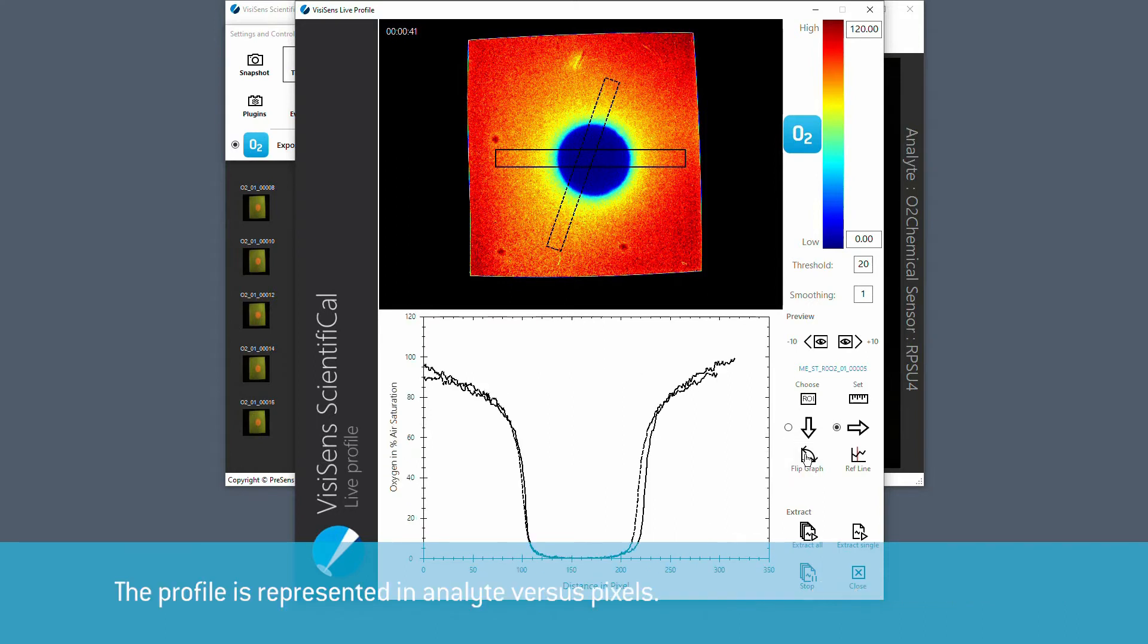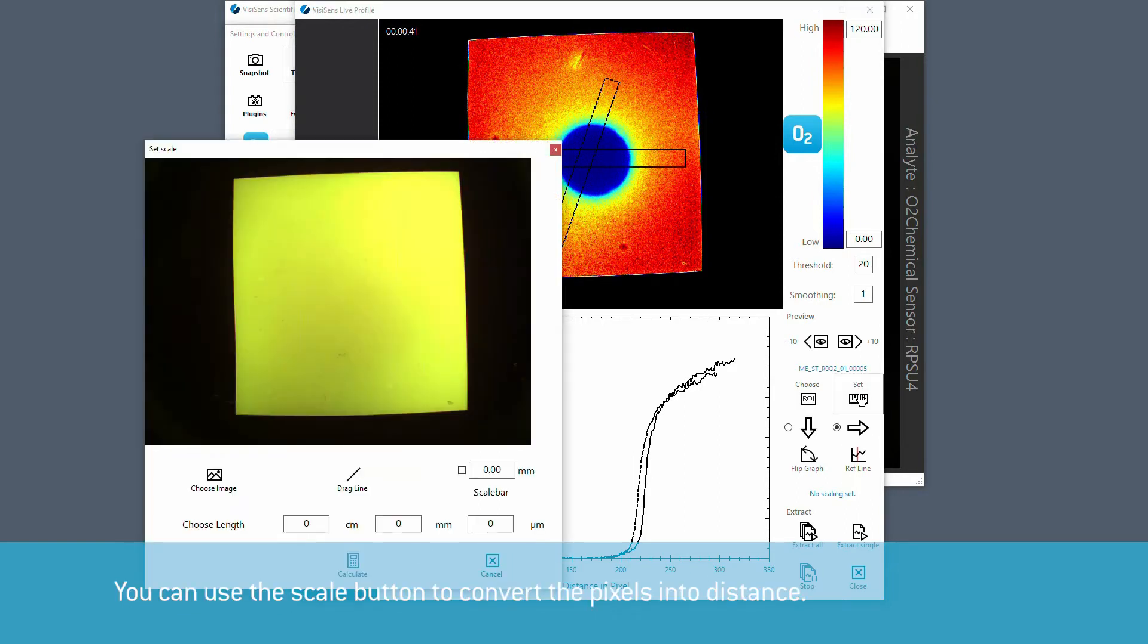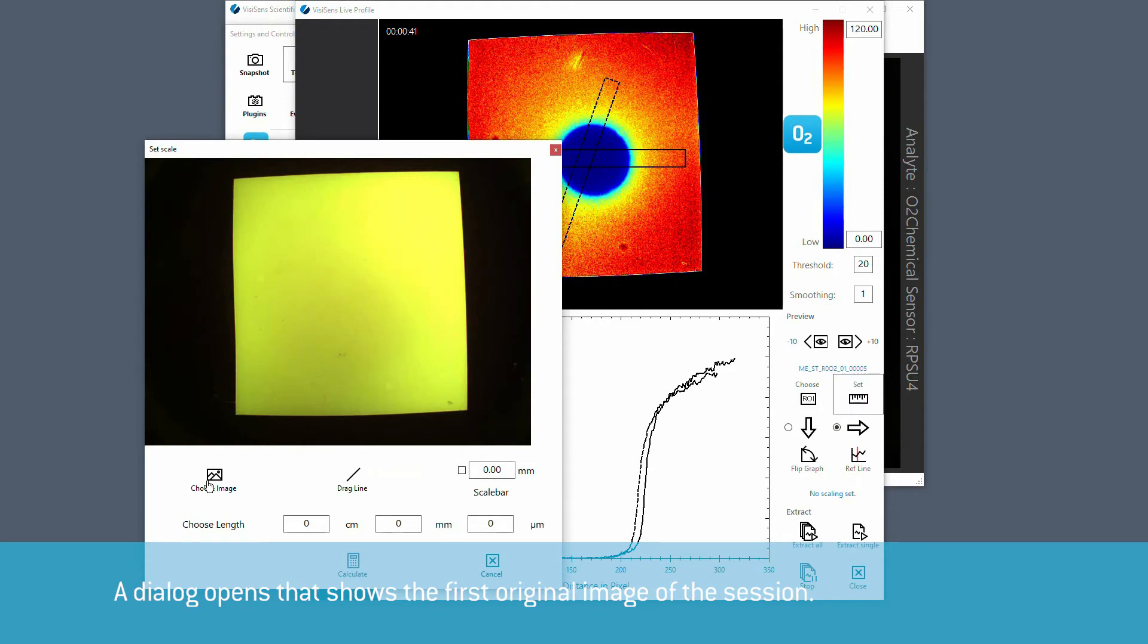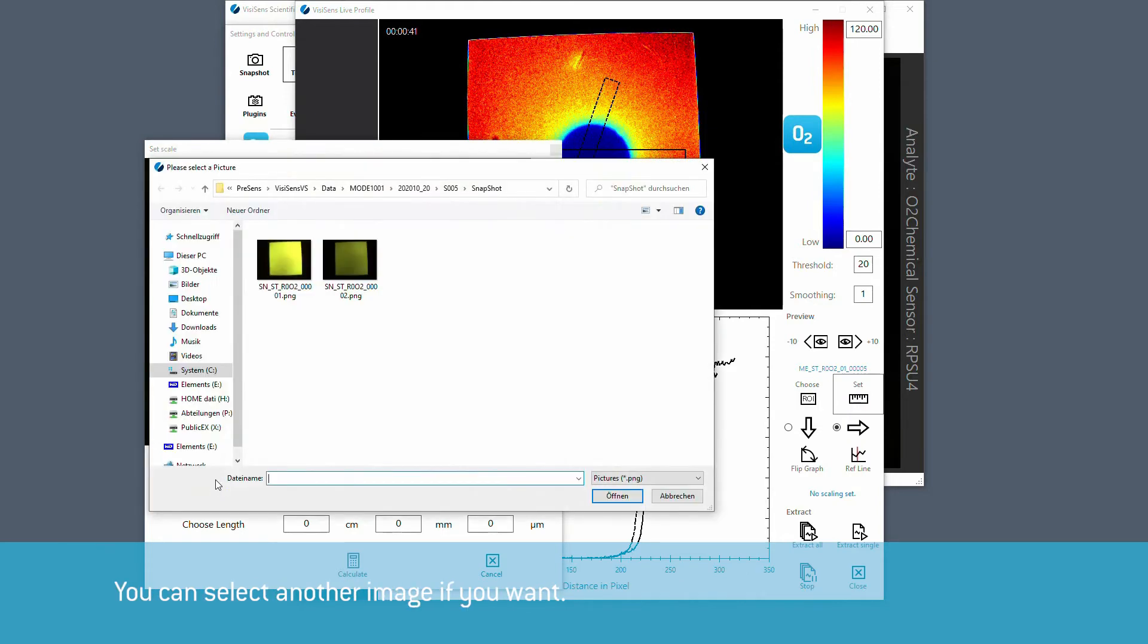The profile is represented in analyte versus pixels. You can use the scale button to convert the pixels into distance. A dialog opens that shows the first original image of the session. You can select another image if you want.